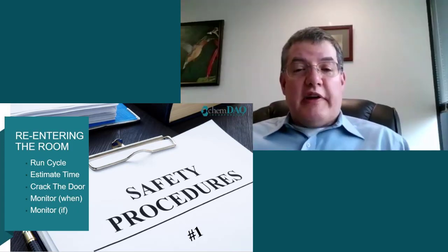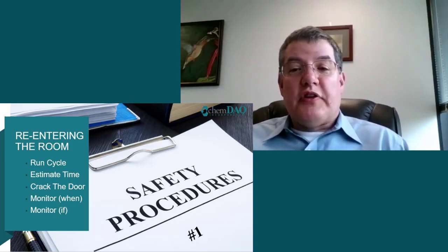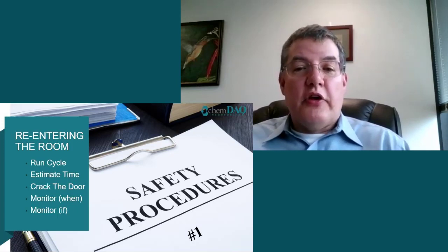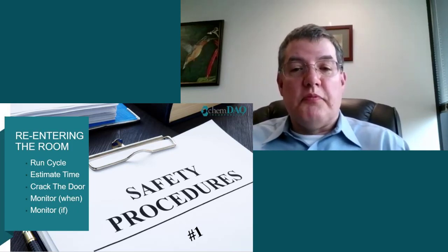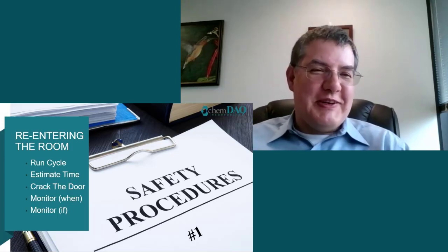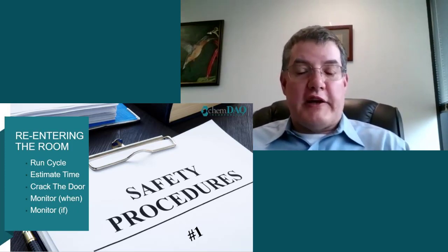I agree, Bob. As I just mentioned, hydrogen peroxide has no odor, and so it is imperceptible until the concentrations are much higher than safe levels. Therefore, the best method to know if it's safe to re-enter the room is to use a gas monitor for hydrogen peroxide. Off-gassing is the second issue that we also need to address. Here's a simple protocol for room disinfection.